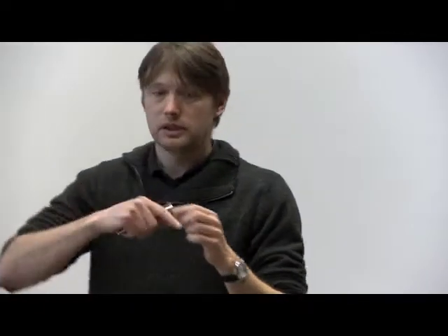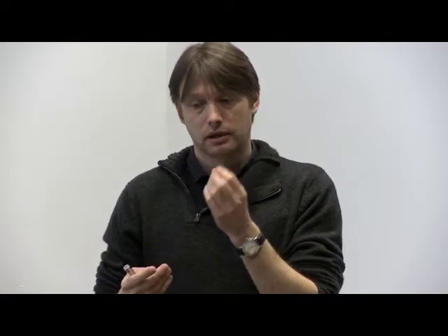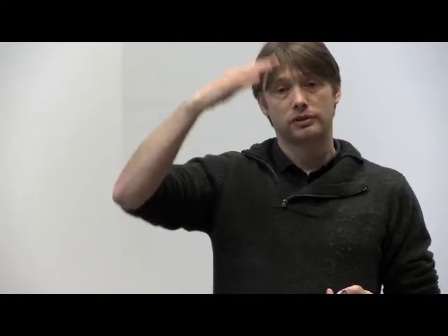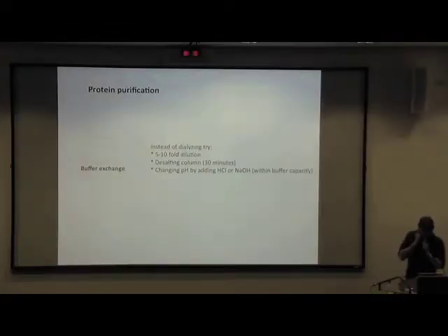Is that when you see a single peak, it doesn't mean that's a single protein. It could be a population of proteins that merge together into a single peak, but in reality they're not. So it's good to run a gel and really carefully examine what's in that peak. And you can do other techniques like multi-angle light scattering coupled to size exclusion to find out if you indeed have a monomeric species over the peak, or maybe you have dimers and monomers in that same thing. I'll show some examples later on.